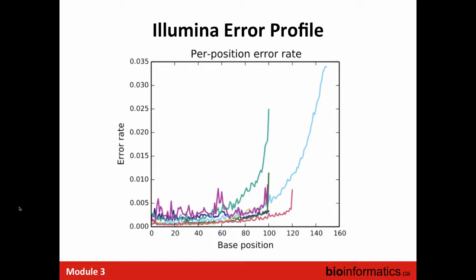Is the error rate or specificity of error random, or does it occur at the same sites? For example, if you use FFPE, formalin-fixed, which is normally degraded and not optimal. It's not random, and that's a very good point, because it depends. This is one source of the errors, this phasing and pre-phasing. PCR amplification can introduce errors. It can introduce stutter in simple repeats. FFPE damages DNA, and you get these cross links between thymines, and all of those things contribute to the error. So it's not random, and it depends on how you've prepared the DNA.